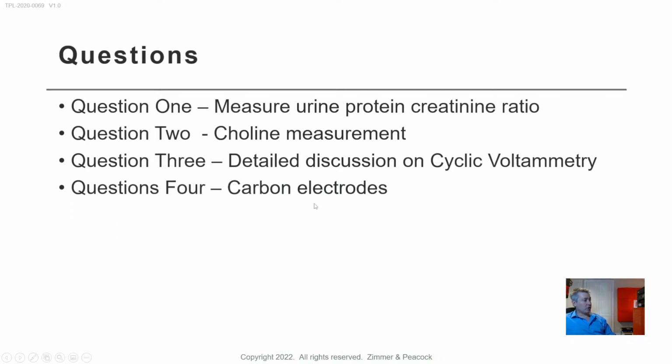And then question number four came in just last night. The inquirer was asking about our carbon 101 electrodes, and I want to contrast that with our carbon hypervalue electrode. So we've got four questions, quite a lot of information.